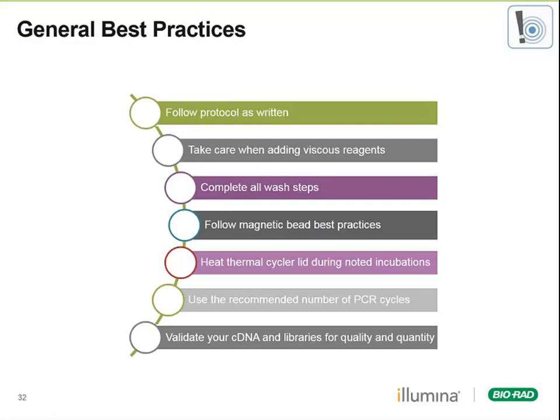Some general best practices first. Always follow the protocol as written. This is a longer 2-day protocol and has some specific steps with the droplet transfer, so make sure we're following each step of the protocol. We use both oil and beads in this, so you're going to want to take care when adding viscous reagents to make sure that we're going slowly and adding the correct volumes while minimizing bubbles.